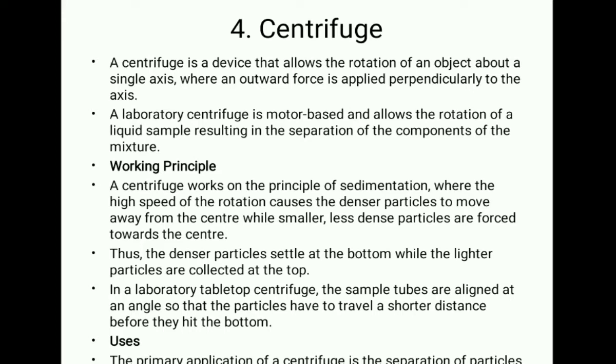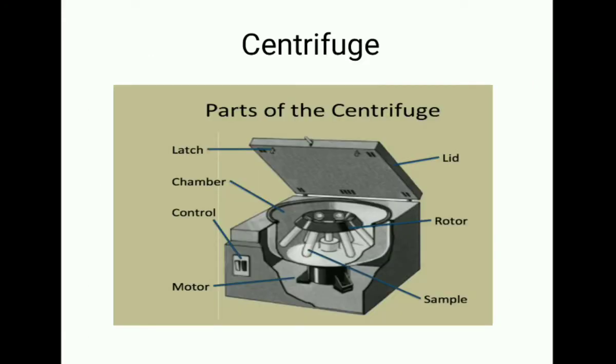Talking about the use, the primary application of the centrifuge is the separation of particles suspended in a suspension. It can be used for the separation of cell organelles, nucleic acid, blood components, and separation of isotopes. So this is the centrifuge.